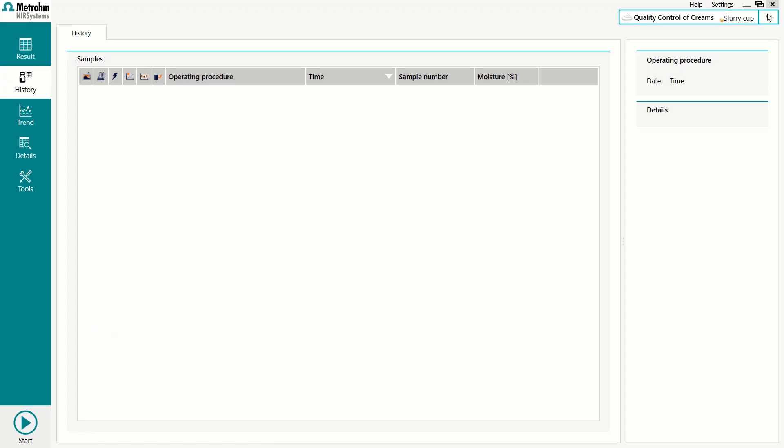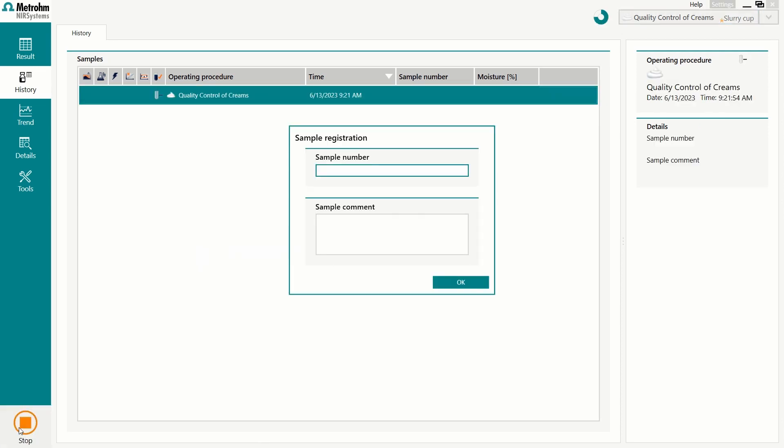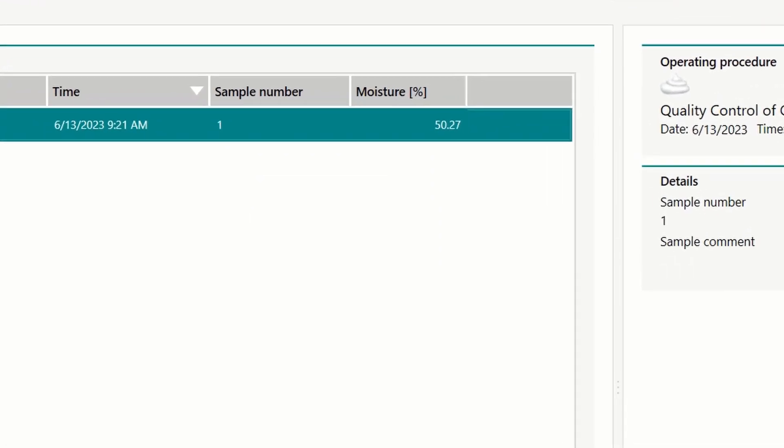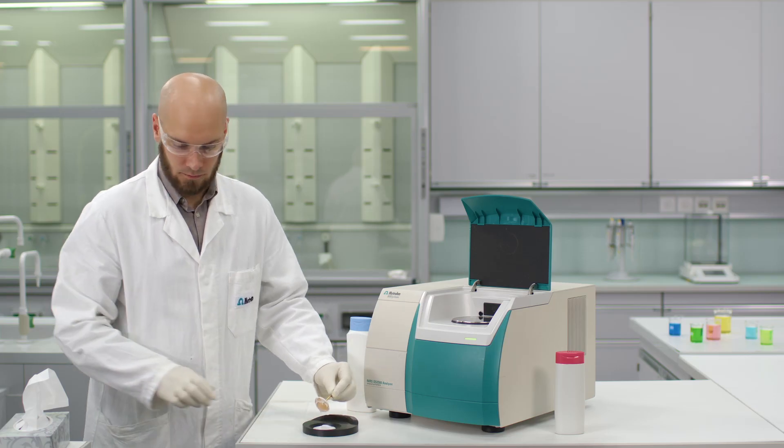Select the corresponding operating procedure in the VisionAir software and press start. In less than one minute, you get the results for the different sample parameters.